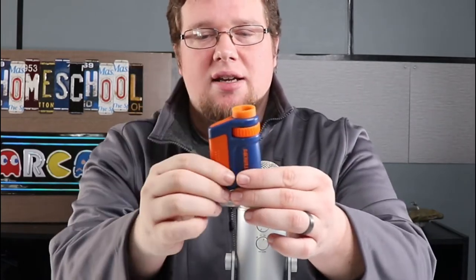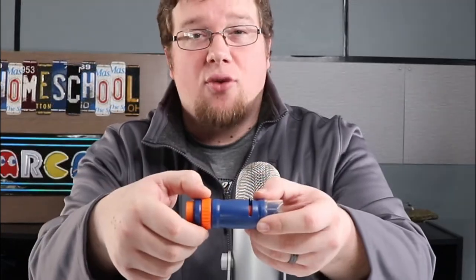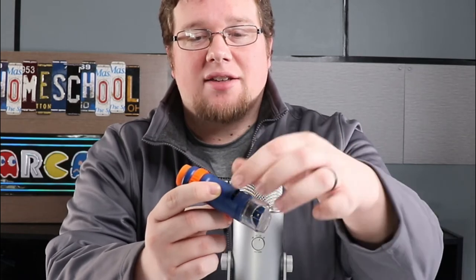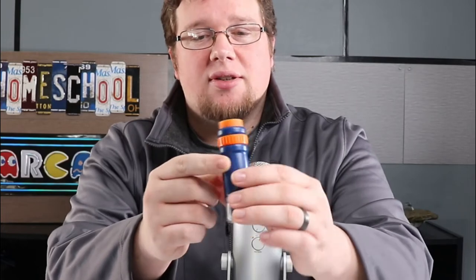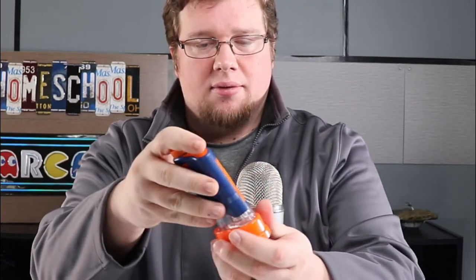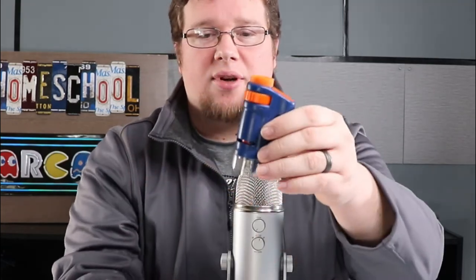It's about the size of my hand. It's made of a very hard kind of plastic. It moves between 20 and 40 times magnification, and it has a little plastic lever that helps with focus — it's as simple as that. And then if I want to quickly take it out and go exploring, I can.